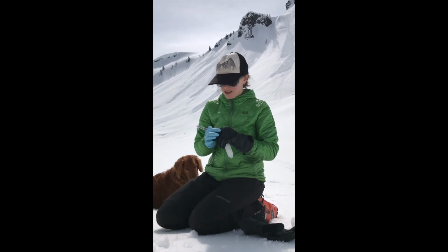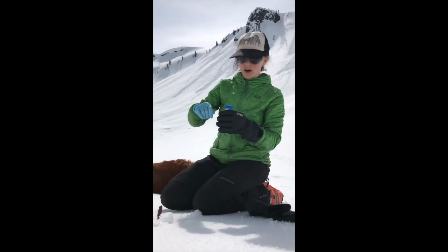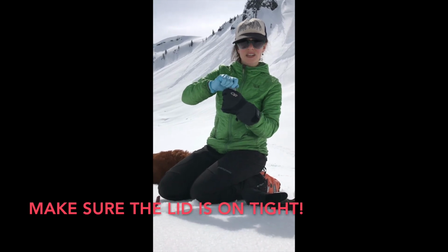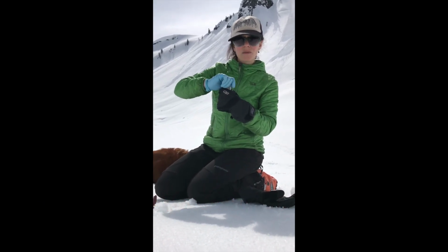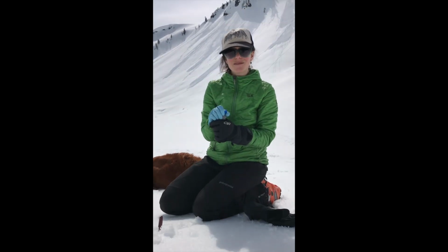And that's it. There might be a piece of plastic in your sampling kit in which you can wrap it around the top of the lid just to keep anything from spilling. And then you can put the tube back in the bag that it came in and drop it off at any of our collection sites within a couple of weeks of collecting.